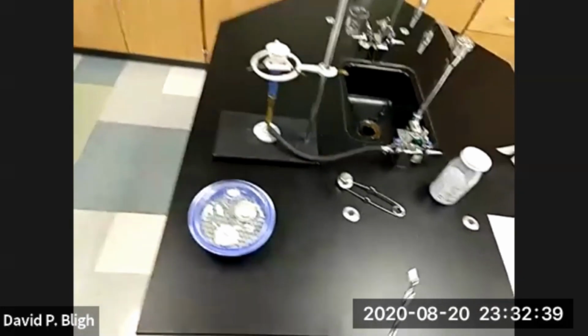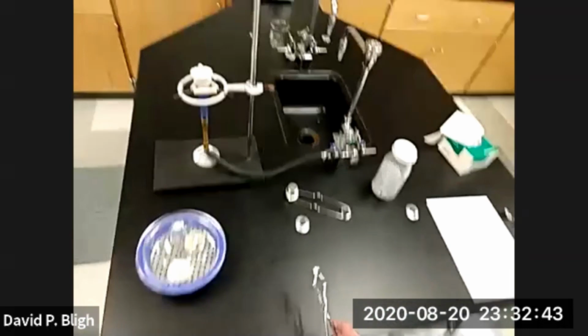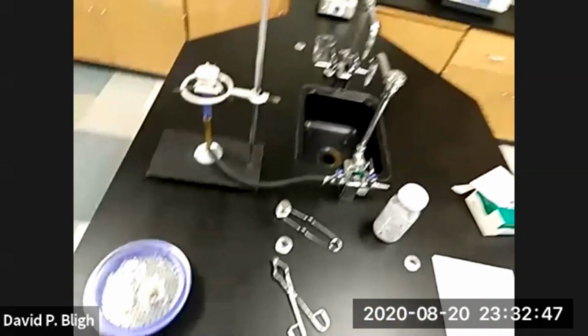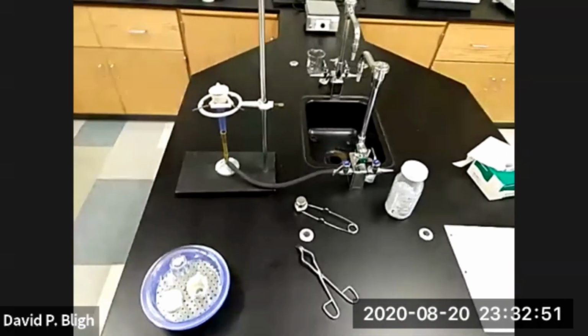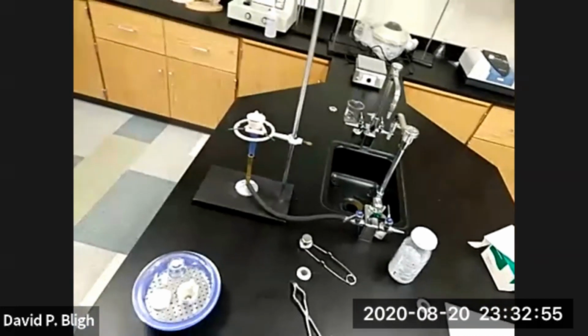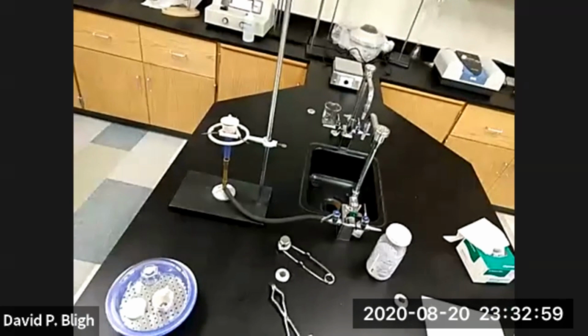So now we need to let it cool. This might actually take 5 minutes because you can't rush cooling. And you'll notice if you don't let it cool all the way down and you put it on your balance and it's still warm, then the balance will not settle down. It'll just keep drifting.